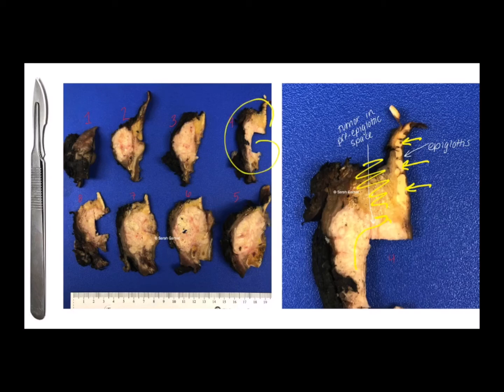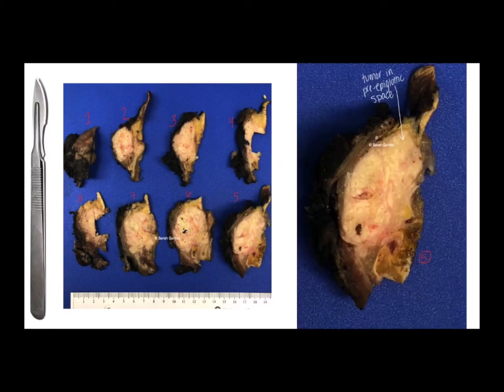So this is this slice here, slice 4. And you can see tumor all in the epiglottis. So you would want to take a section there documenting the tumor extension into there. And you can again see it inside that soft tissue and abutting the inked surgical margin.